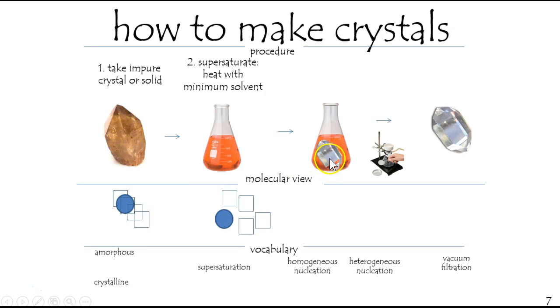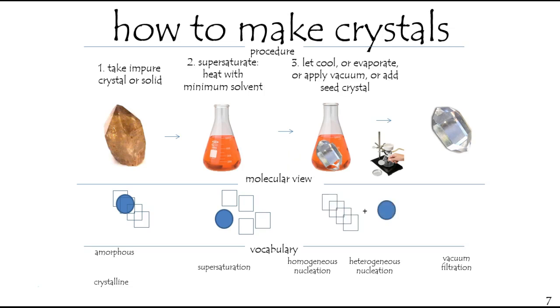There they are. Now, before we filter, we need to recrystallize that material. There's a few tricks for that. You could just let it cool. You could evaporate a little bit of the liquid. You could apply a vacuum. You could add a seed crystal. And we should see the crystals forming sooner or later.